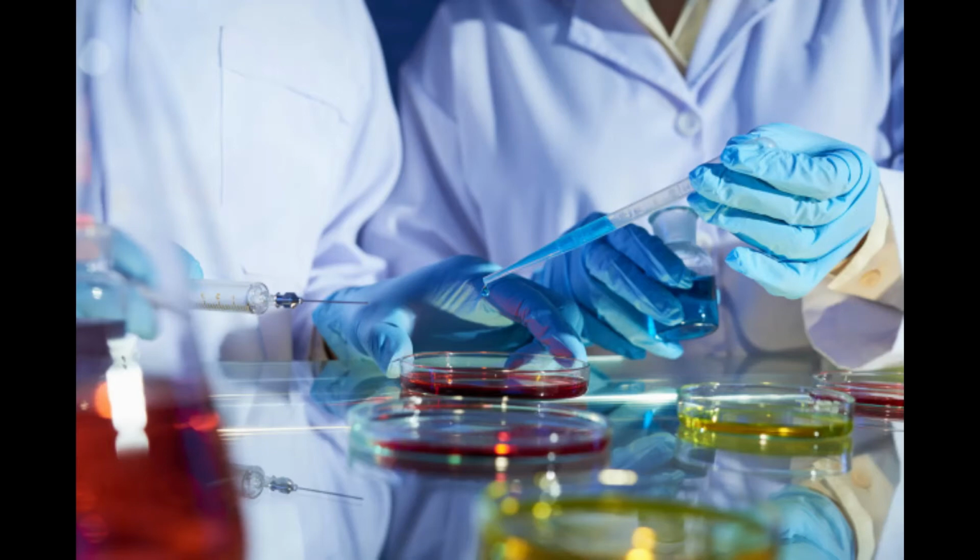The deep tube. The deep tube, you're going to use a needle on. An inoculating needle. The deep tube is the other tube that has the agar solidified straight across. And this one, again, the procedure's all the same. You flame everything, dip your needle in there. Try not to set anything down.